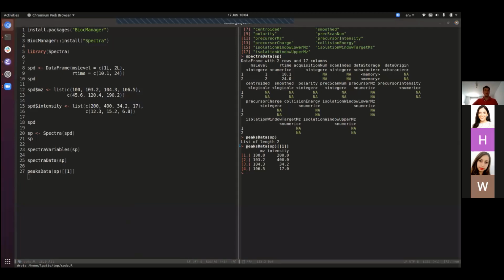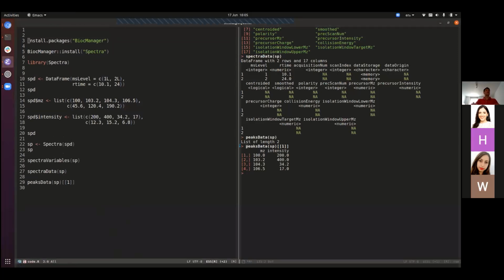And so what I would like to do now is to repeat what I have done with a tiny data set, but do it with a larger real-life data set. Okay, so let me add some commands. I can share this piece of code afterwards.